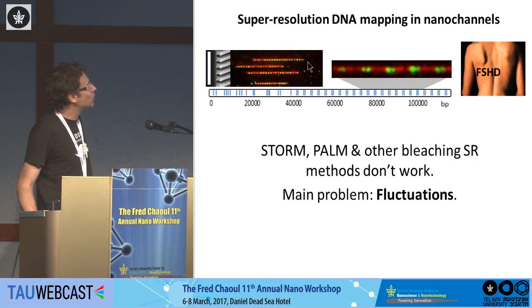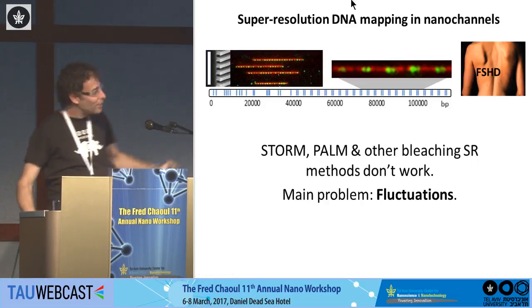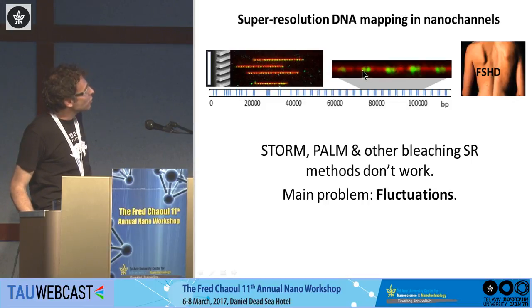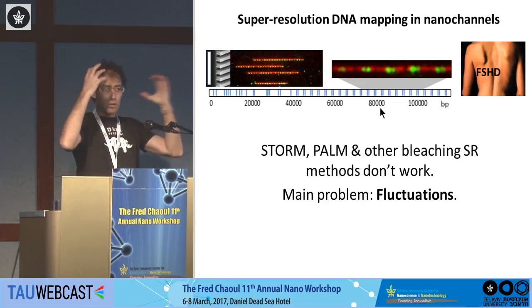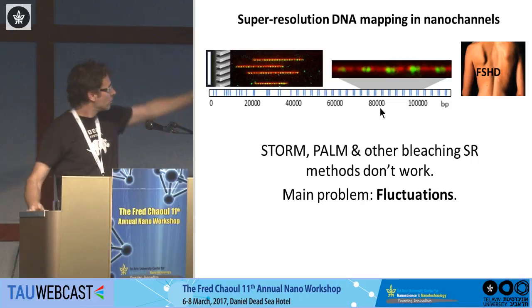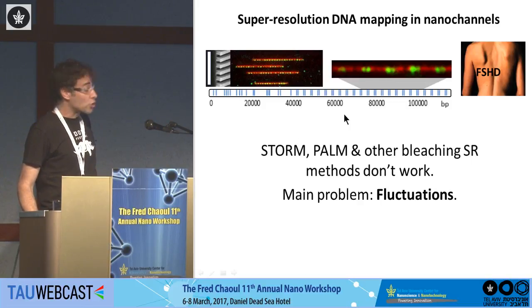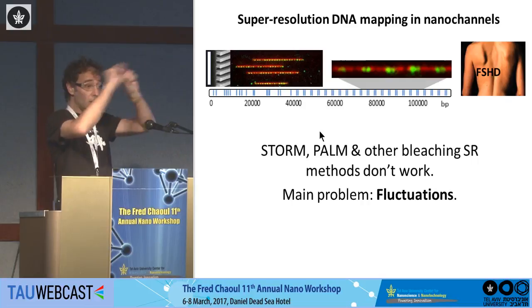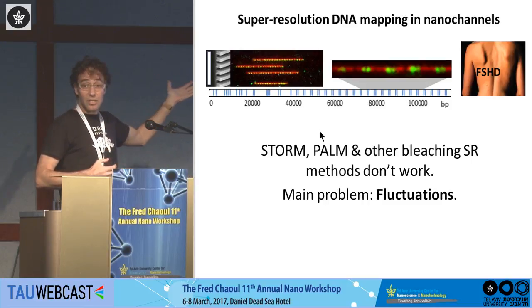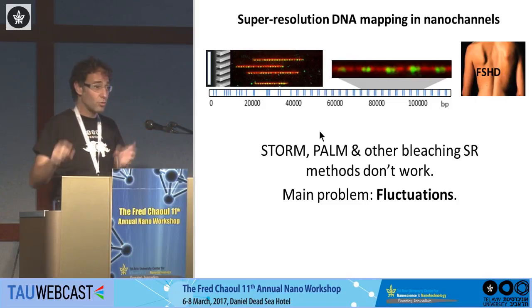Listen, when you take these structures and now you stretch them, you take this double helix and you stretch it open, you find out that each one of these spots is actually composed of two fluorophores. These fluorophores are 670 base pairs away, so they are too close to be resolved optically just in the channels. This is why we see them as a single spot. Now, super resolution basically knows how to take care of these kinds of samples by inducing, for example, blinking, and just turning on each one of these fluorophores at a time. But in our case, the fluctuations are killing us. Because if we just induce blinking, we never know, because it's fluctuating, if it belongs to the left or the right molecule.